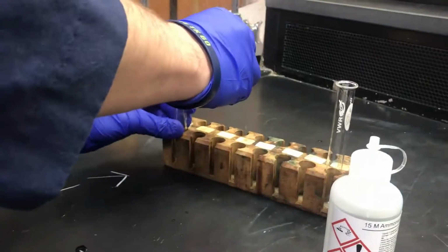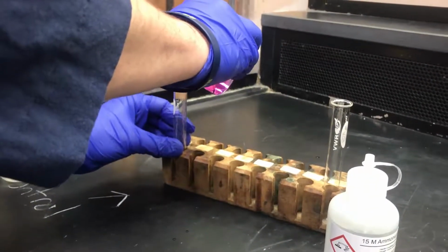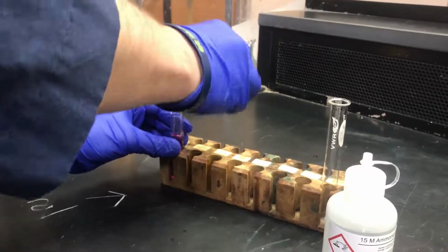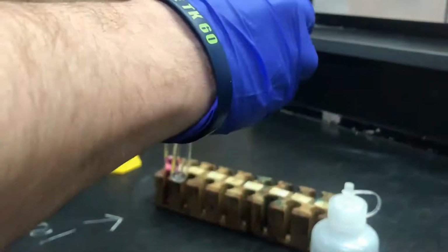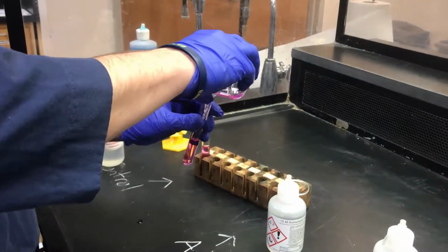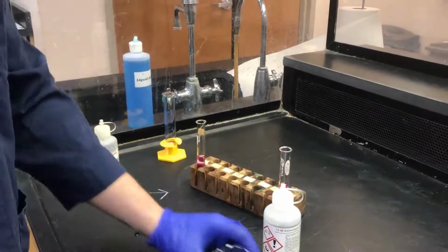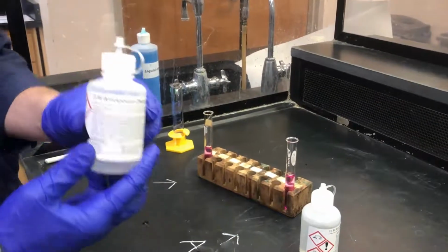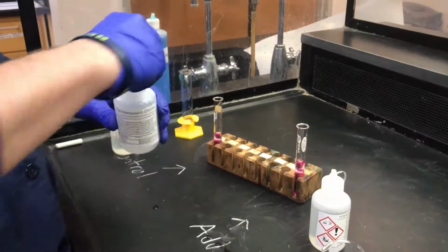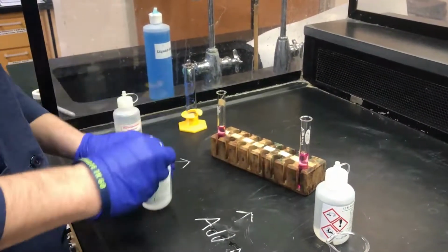So now we will distribute this solution equally between the 2 test tubes. So one test tube is our control, we won't do anything to that. But to this second test tube, we'll add about 2.5 mL of 2 molar ammonium chloride.